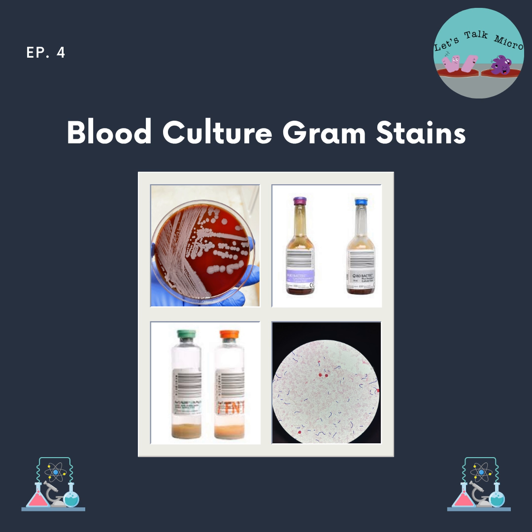So now that we have our slide, we take it to the microscope. Our slide is ready. And then what do we report? Do we look for the same things? For the same elements? Same objectives? Yes, everything is the same. 10x and 100x. So we're looking for the same elements.